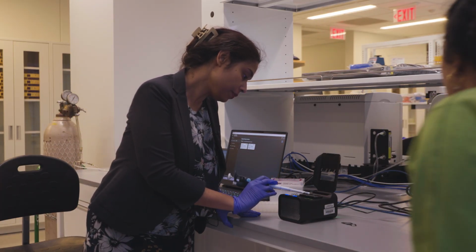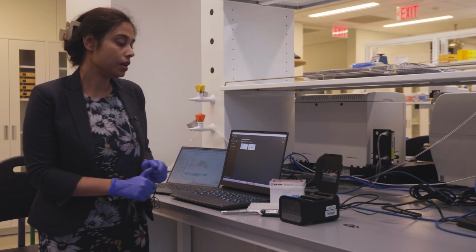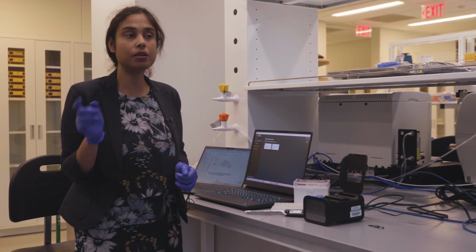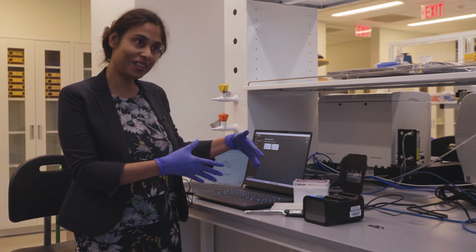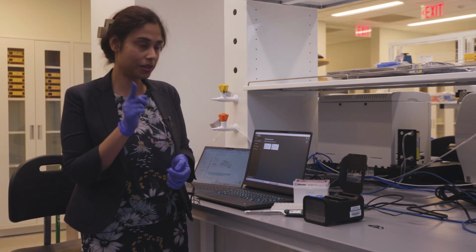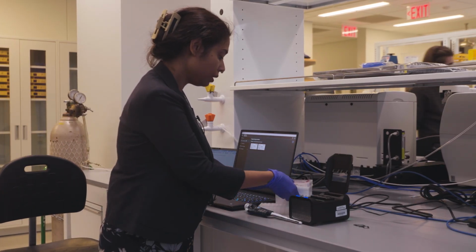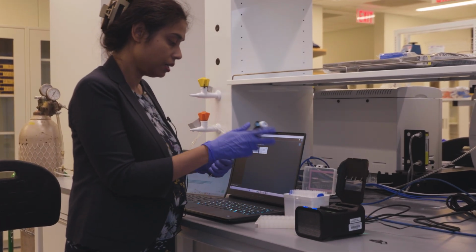Okay. Yeah, you'd be able to see it. So the first thing we are gonna do, we are gonna take out, let's say 20 to 30 microliters of the buffer, whichever is inside already, so that the air pocket is gone. So that is the first thing we are gonna do. So the way we do it is, we are gonna take 1 ml pipette tips.